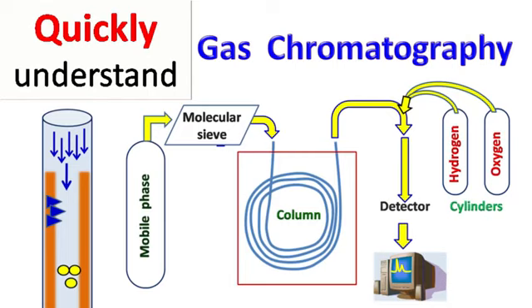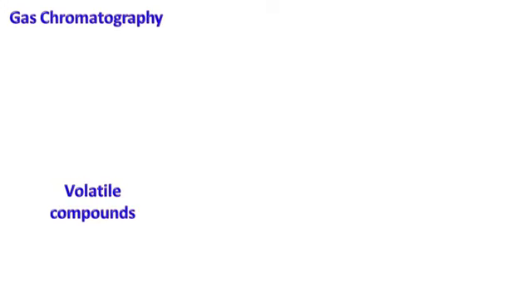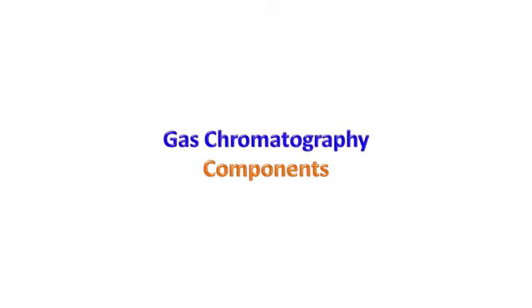Let's talk about gas chromatography. Gas chromatography is a chromatography technique used for the separation of volatile compounds. Volatile compounds are the compounds that get easily vaporized at room temperature. Let's see the components of gas chromatography.